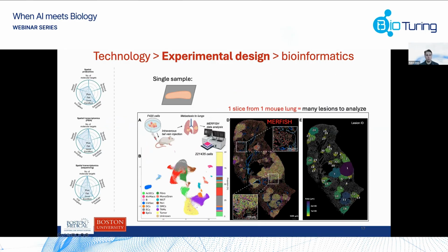Sometimes you get one slice from one mouse lung, and this is a mouse lung with metastatic lesions of osteosarcoma. This is where we inject some of these cells in the tail vein, and they go to the mouse lung and develop these lesions. Now each of these individual lesions are potentially individual tumors, so we should treat them as such. We cannot just consider that a single sample. It's actually multiple samples embedded in a single sample.